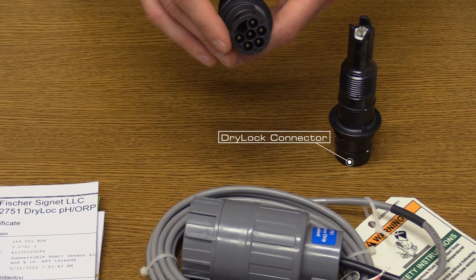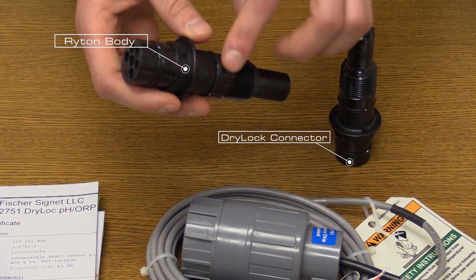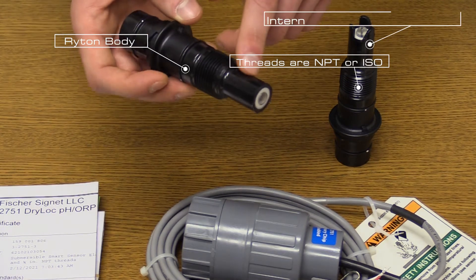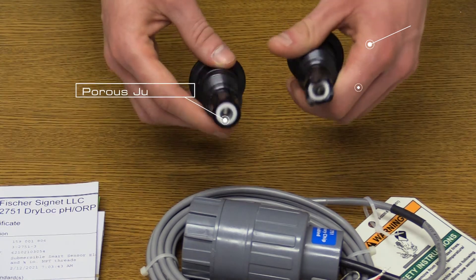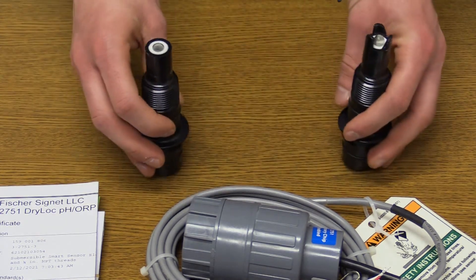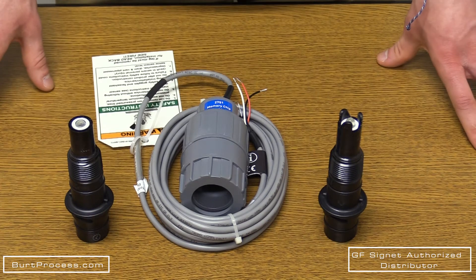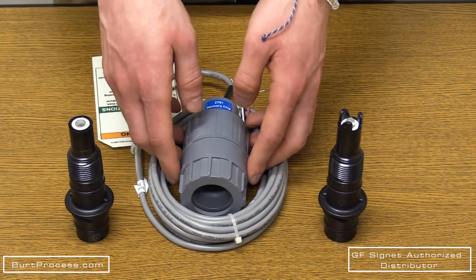The 2724 and the 2726 both have the Drylock connector with corrosion-resistant gold pins, Ryton body threads for NPT or ISO connection, and an internal temperature sensor with a porous reference junction.